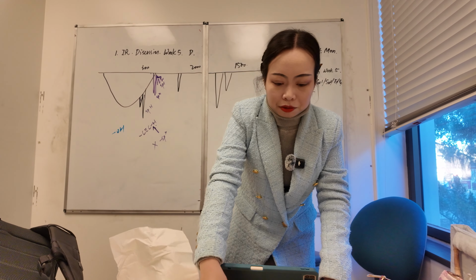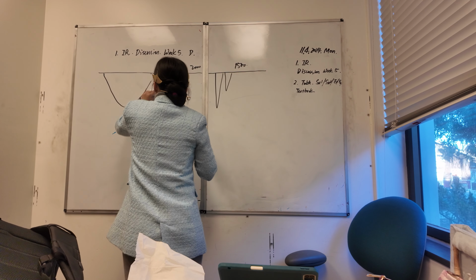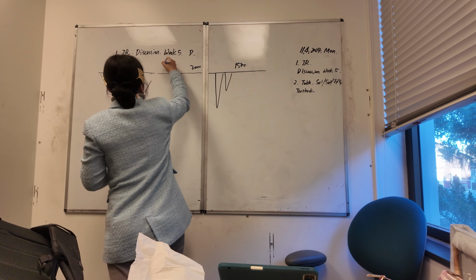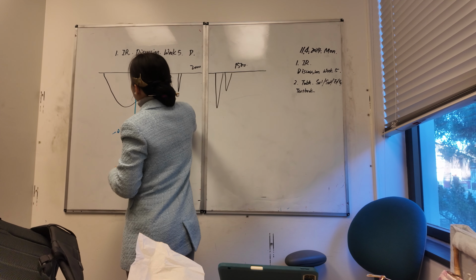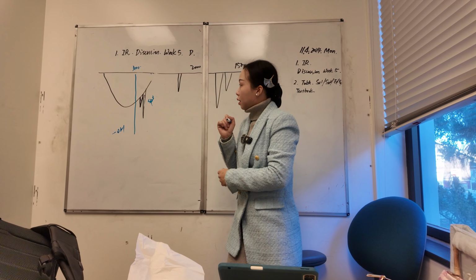So the one that I was working on, if we go back to your compound D, I think 3000 is more or less like here. Then it's sp3, okay. Are we good?